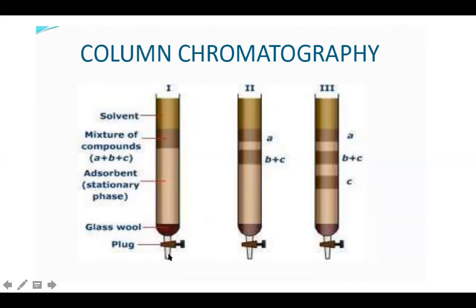So you can collect 10 ml of each fraction, and in the fraction by using TLC you can see how many compounds are there.